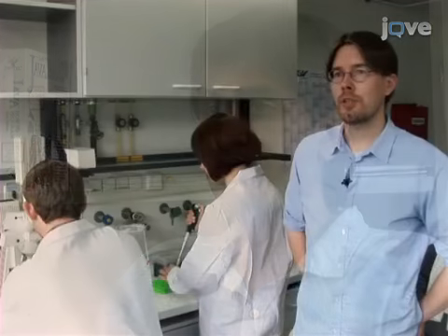Though these methods specifically provide insight into CRISPR-RNA maturation, similar template preparation strategies can be adopted for other RNA processing systems. Demonstrating the procedure will be Judith Zoephel, a graduate student, and André Plagens, a postdoc, both from my laboratory.